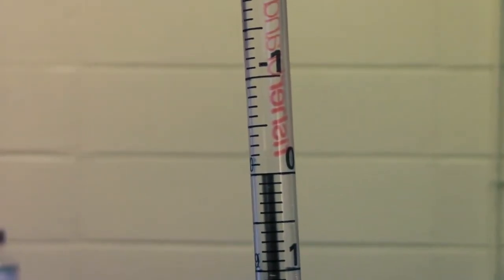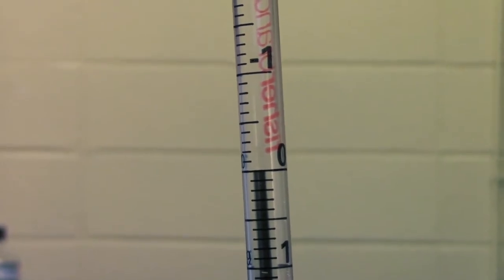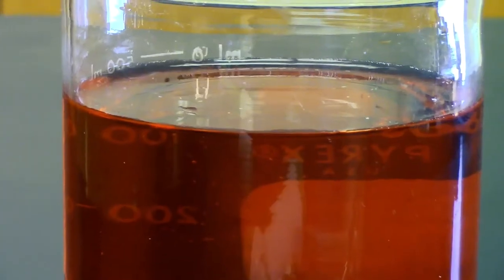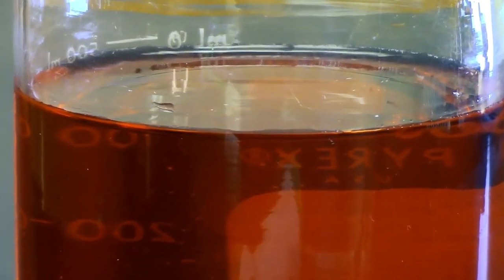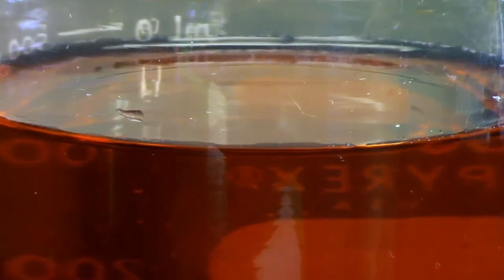There are little lines on the side of the pipette that act like a ruler to help you measure the liquid. Always measure the liquid amount from the bottom of the meniscus. What is a meniscus?